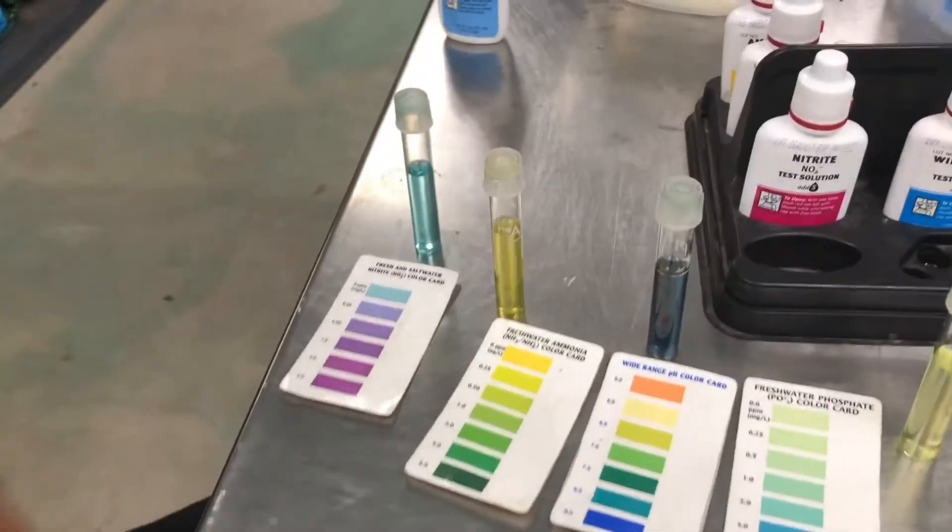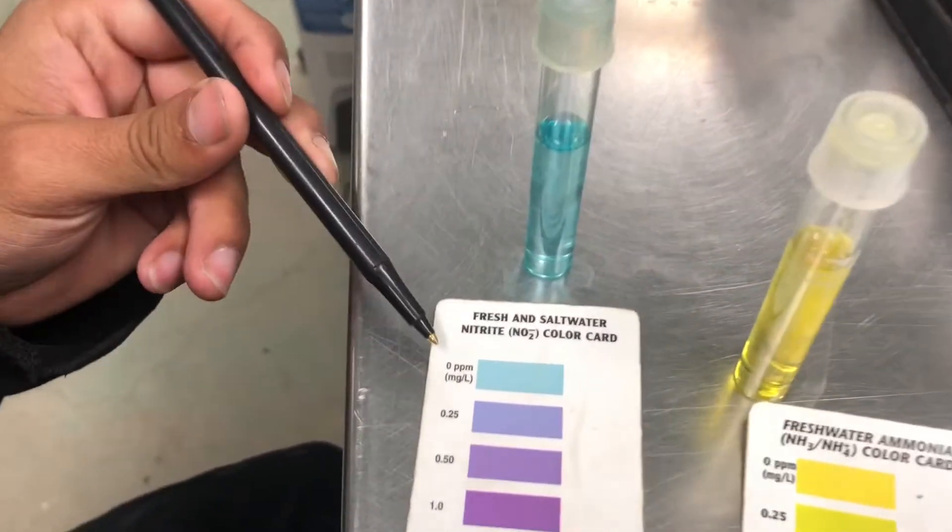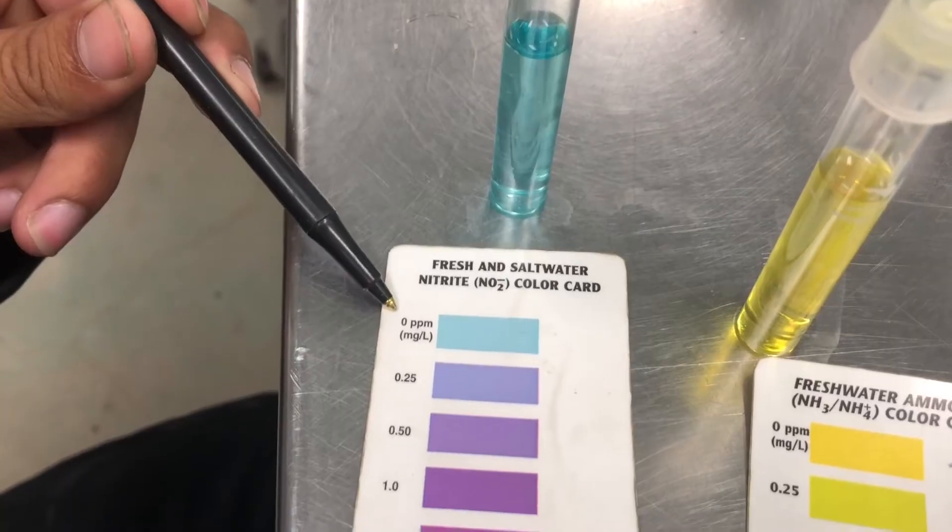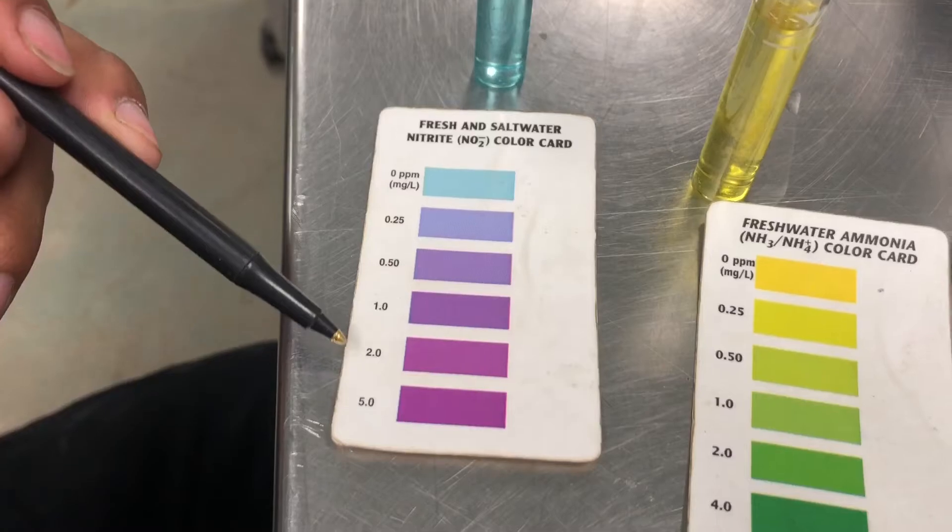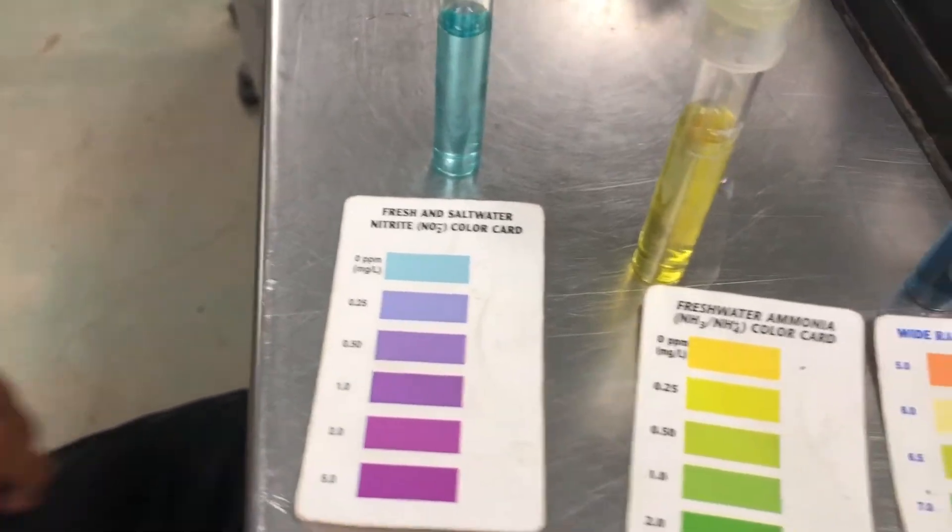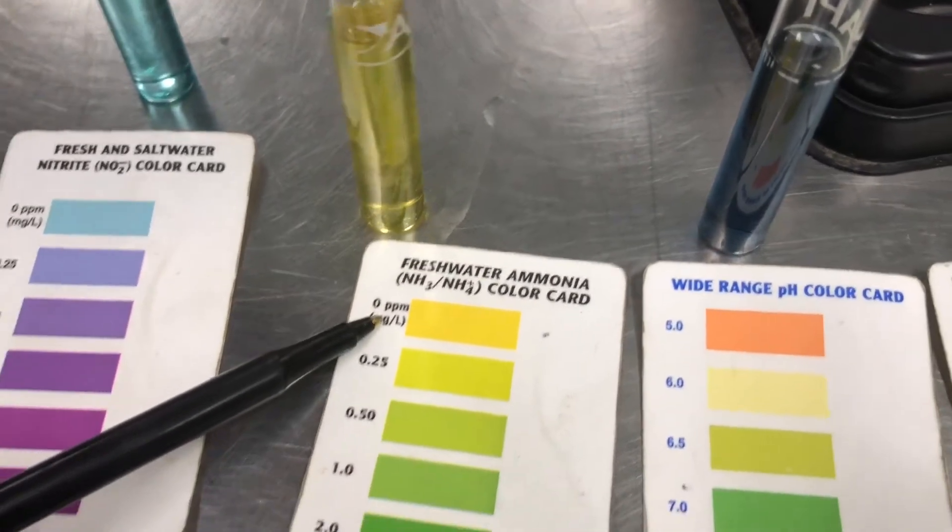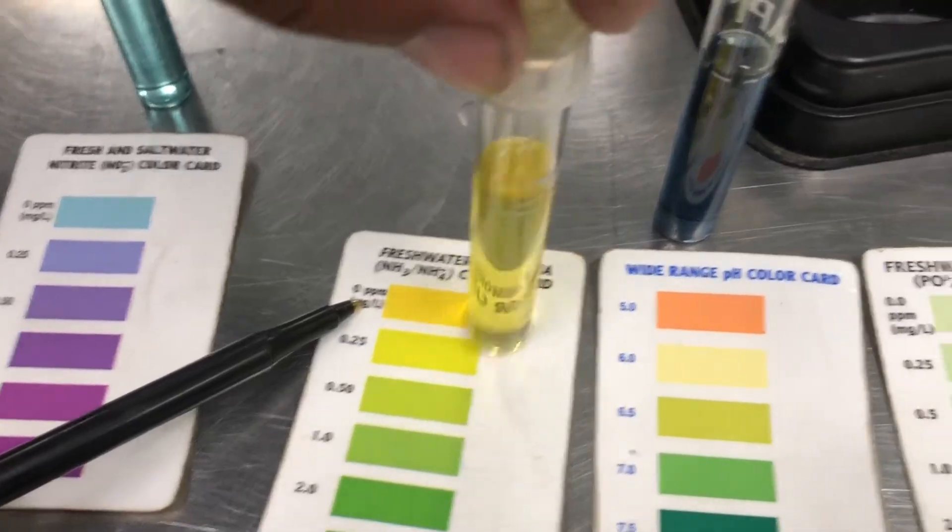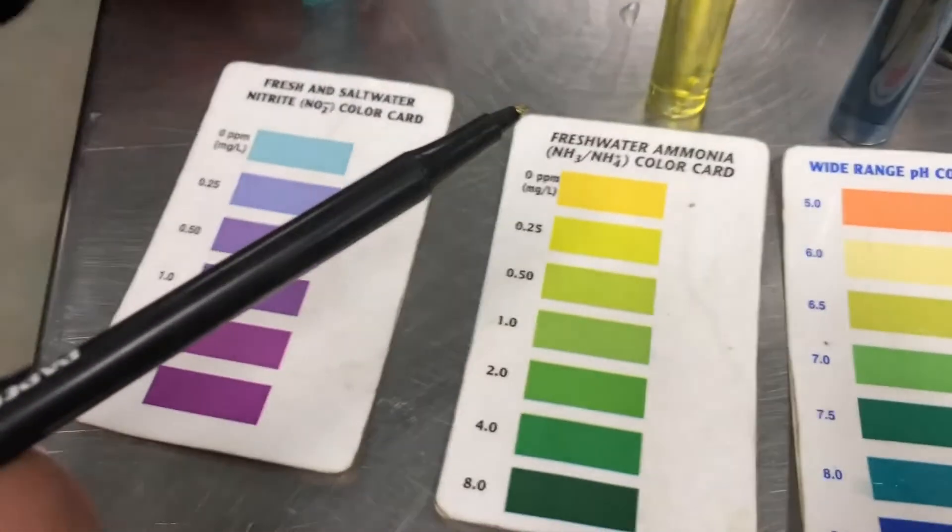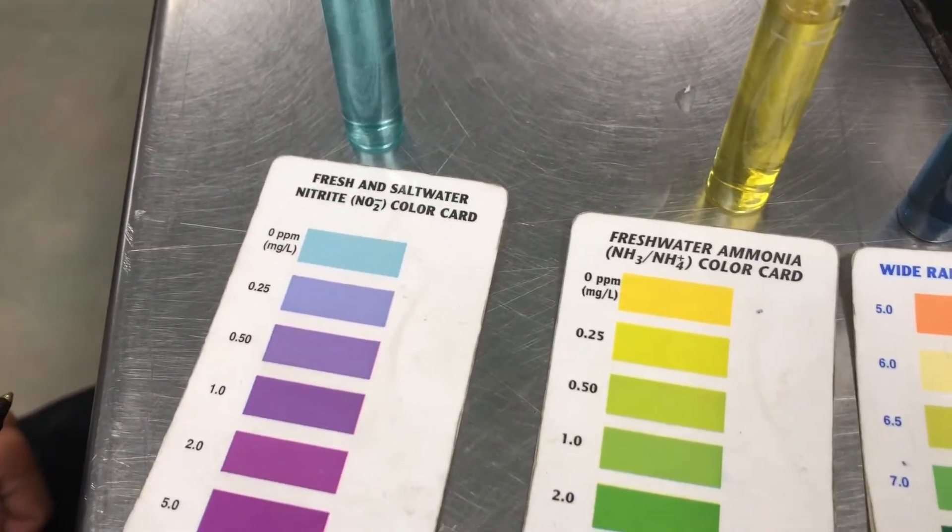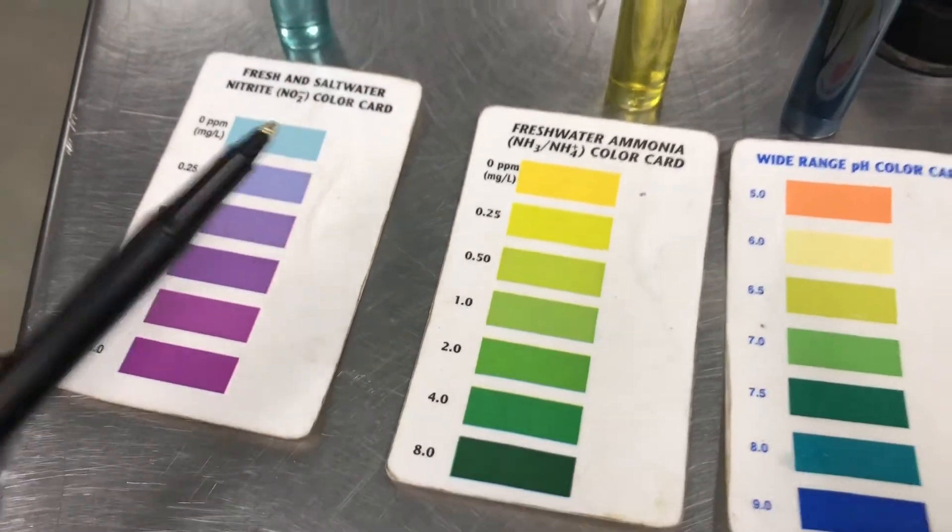So for most of these charts, they really should be closest to zero. So this one is your nitrites. Zero is perfect. And of course the higher, or the more purple it gets, the more danger you have. The ammonia, same thing. Zero is obviously perfect. And as you can kind of see, as you set the vial next to the colors, that one's showing almost zero. So that is perfect. And of course the more green it gets, the more toxic the water is getting.